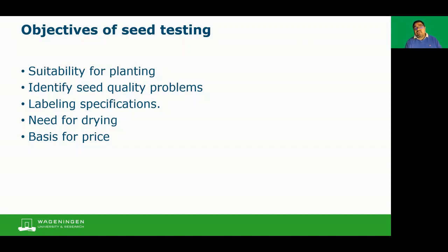And then we have to identify the seed quality problems. Is there any issue with germination? Some issues with physiological conditions, or if there are some abnormal seedlings or something like that, and to meet the labeling specifications.